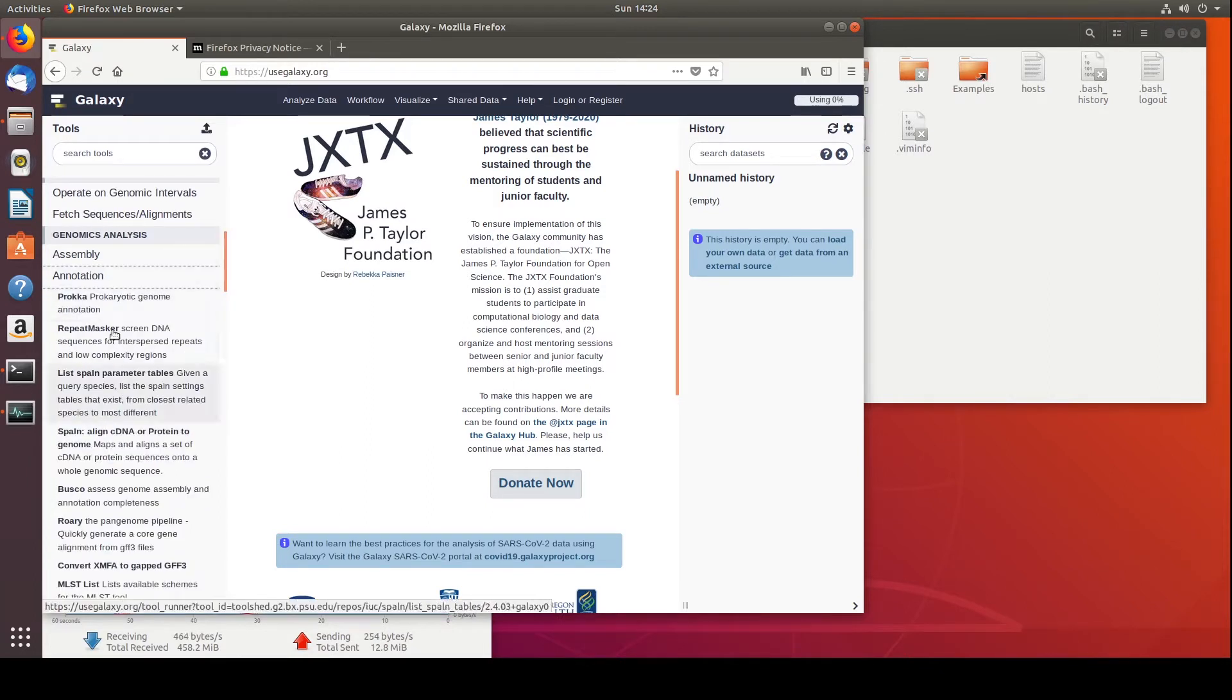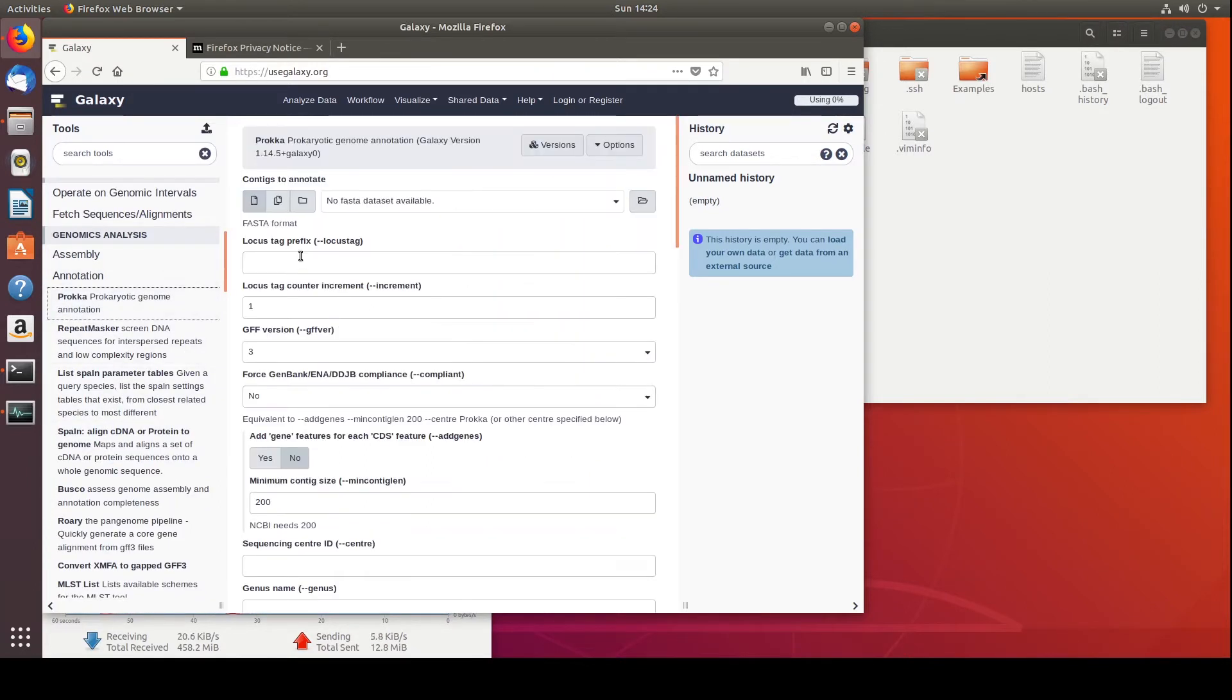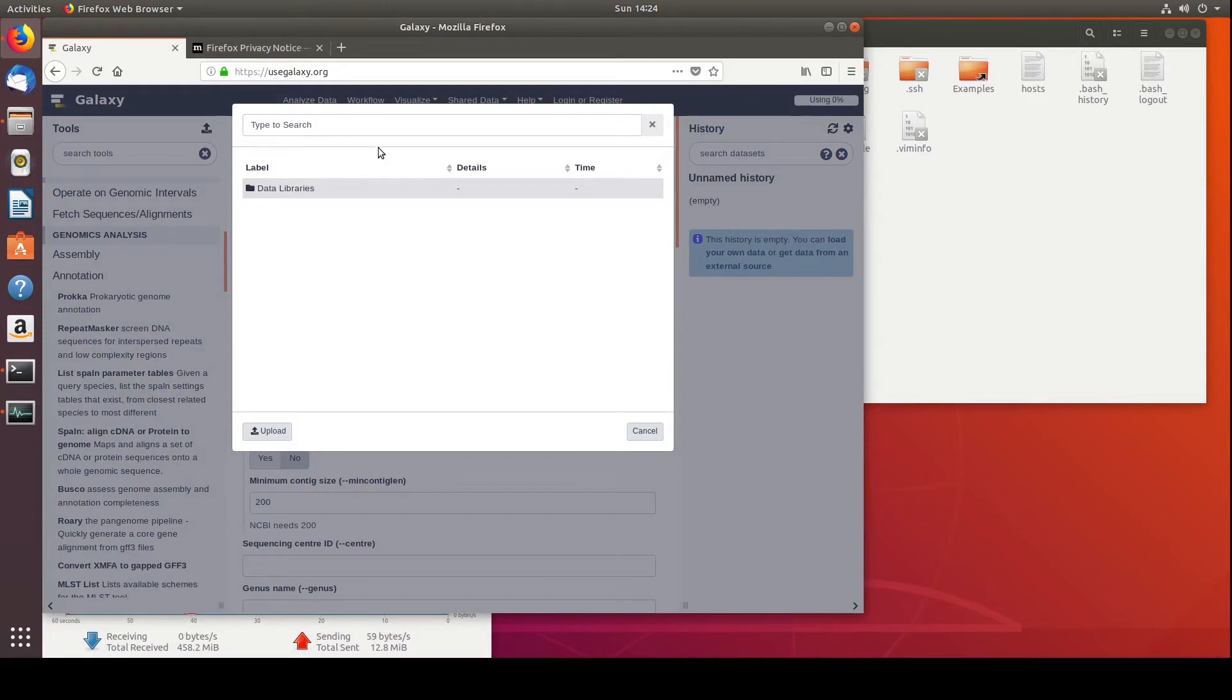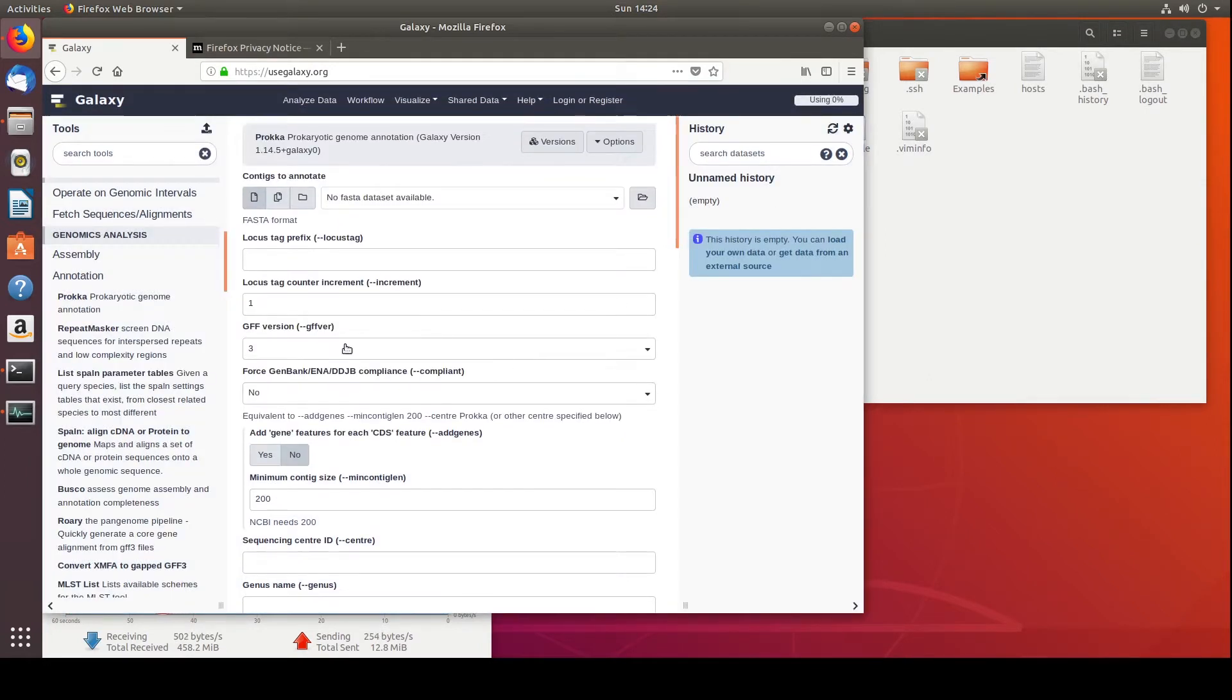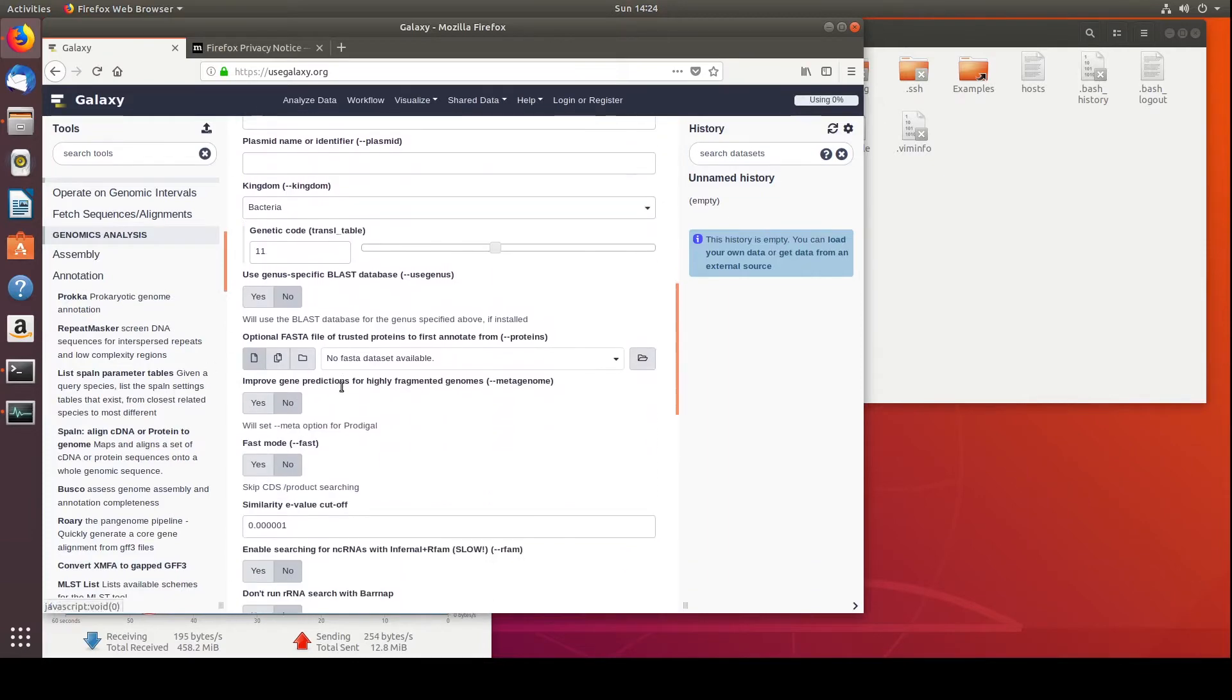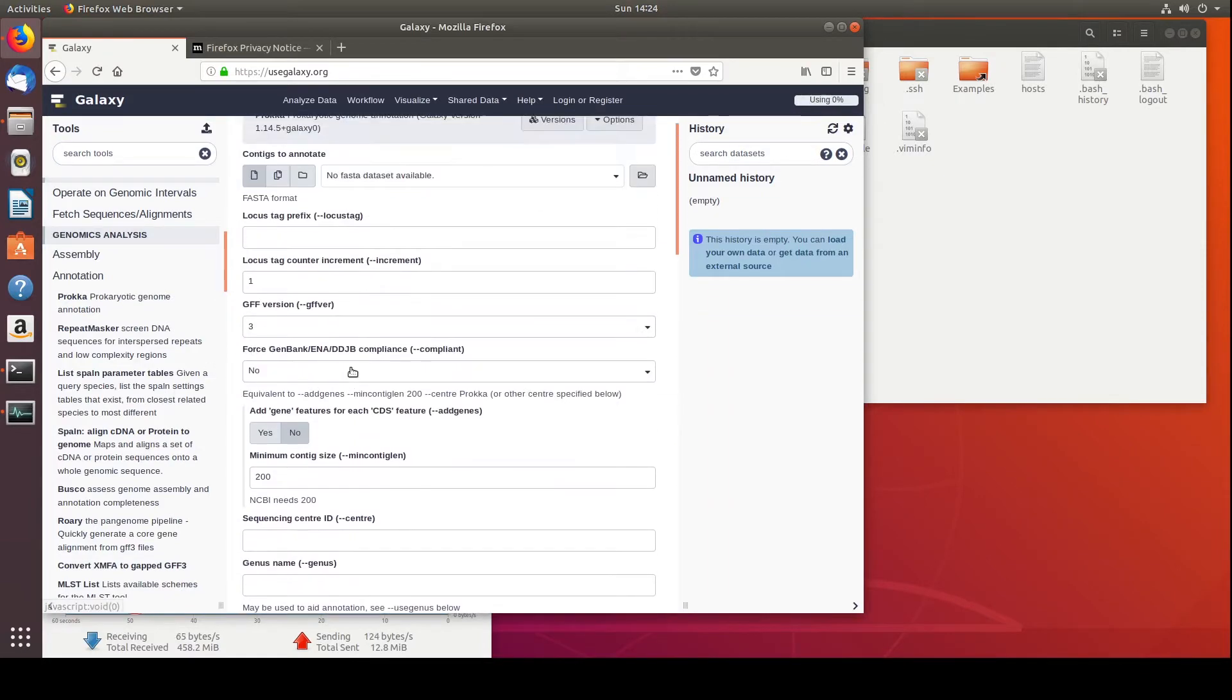So if we want to annotate, we can find Proka, and here we can upload our data, and our data will show up here on the right-hand side, and then we can select it. We can also upload new data, but yeah, so we select it, and then we can choose all the different options here versus typing them into the terminal.